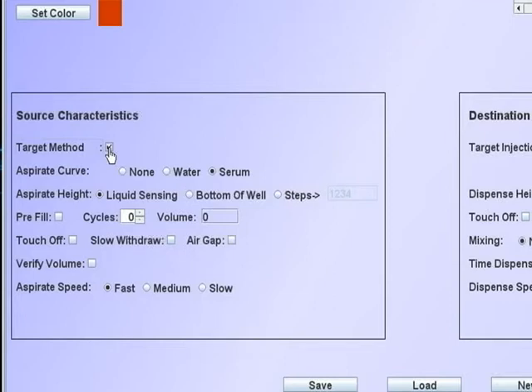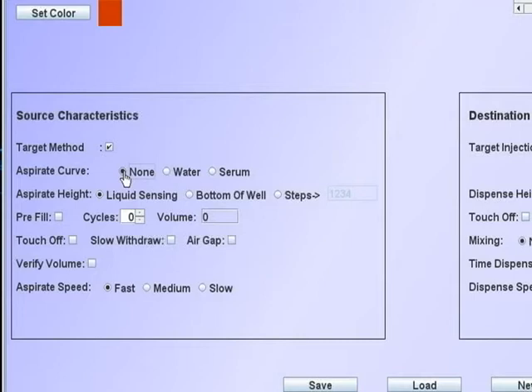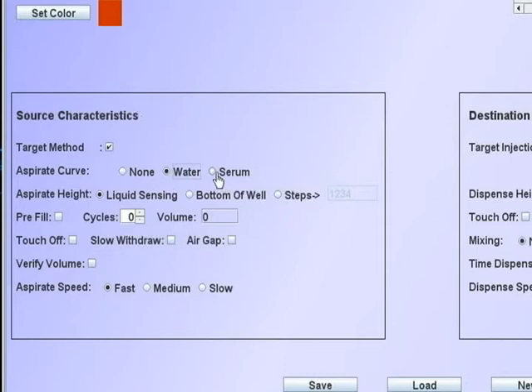The aspirate curve defines the calibration curve that is to be used for the aspirate function. None is used only for calibration and then it is set at 16 steps per microliters. The formatter can accommodate a calibration curve made with water or serum. The latest curve will be used when either is checked.